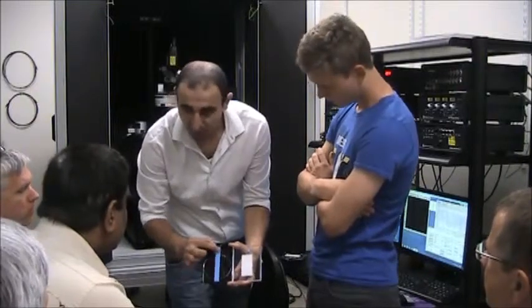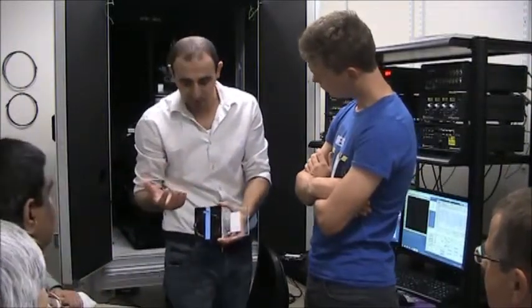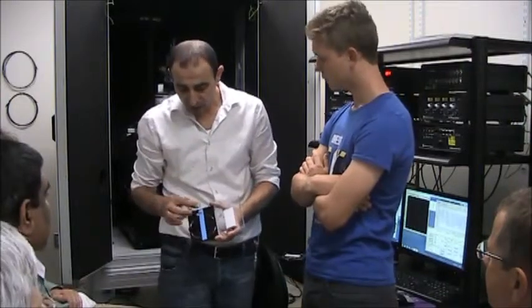So you will have a very small light source coming out from this position. You can use it for NSOM measurements for high resolution optical imaging, or for optical nano manipulation, or activating a specific location on the sample. The aperture could be 50 nanometers, 100, up to microns. Okay? So this will be delivering the light.